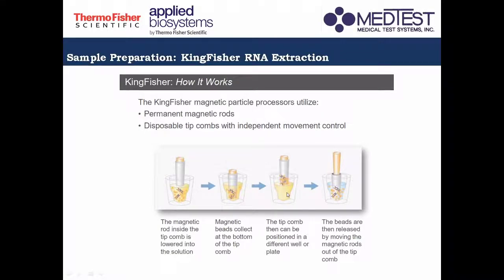Now, the next step is that it will wash the beads using the wash solution and a solution of ethyl alcohol, no? So that your beads will be further purified, and then at the end of the process, you will only get the target RNA.